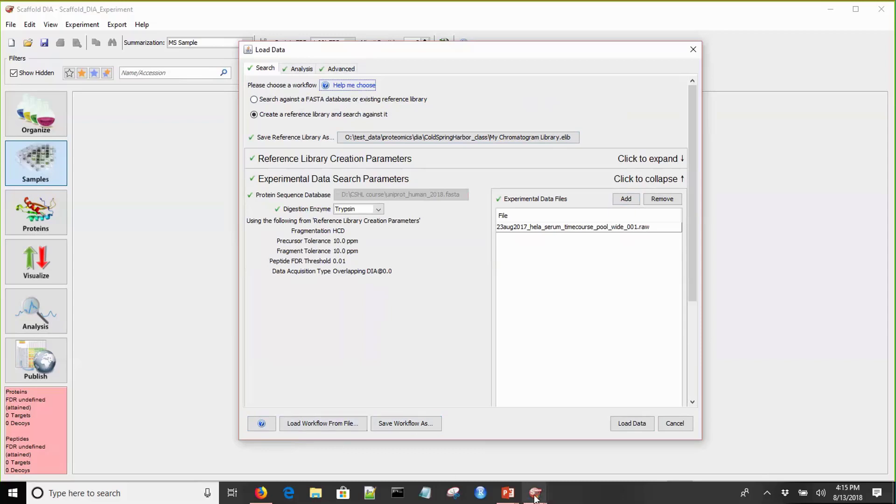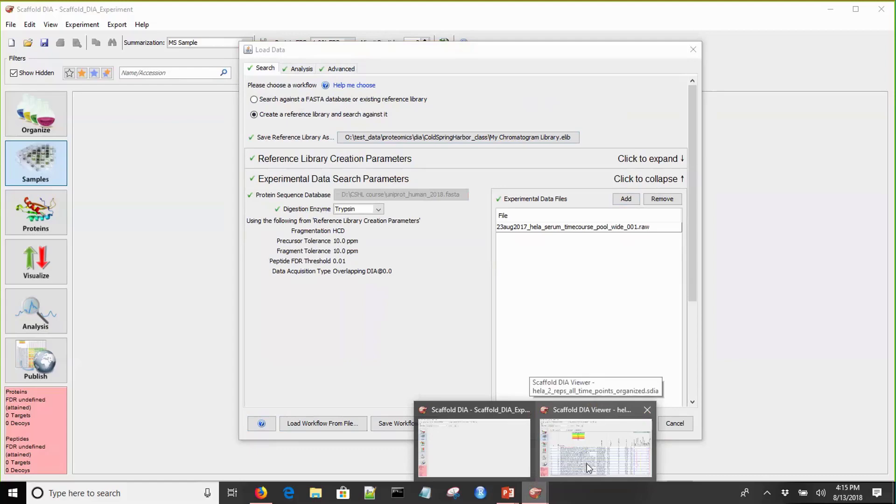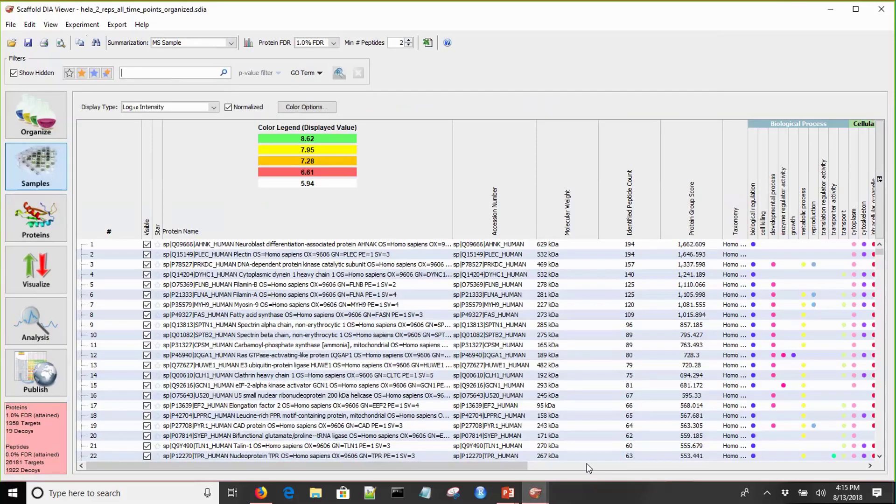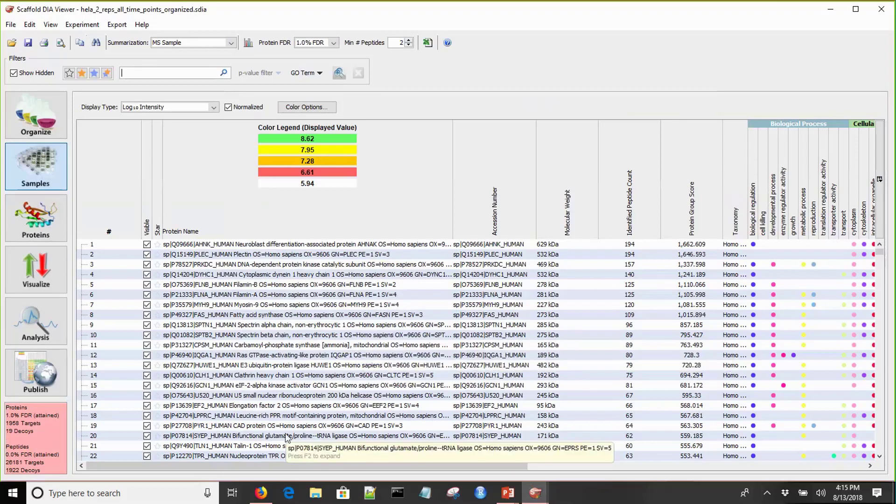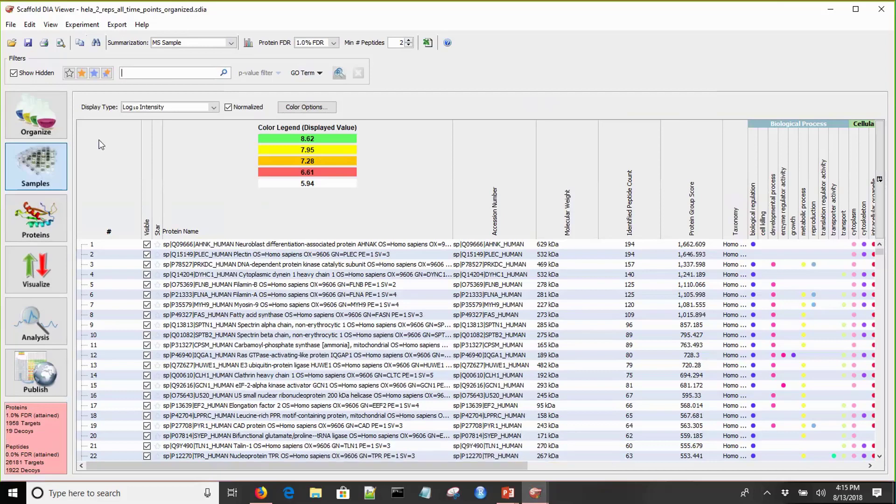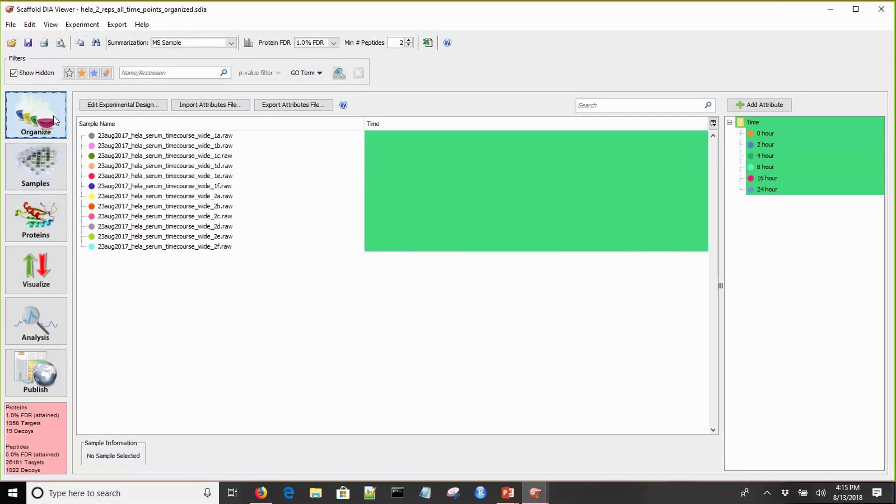I've gone ahead and processed a file, and this is what it looks like once it finally loads. You see all your proteins of interest are listed here. Before we start looking at some of this data, we need to organize our experiment. What does that mean? Well, organizing files in Scaffold DIA means that you've tagged your samples with attributes that explain or define what those samples are.